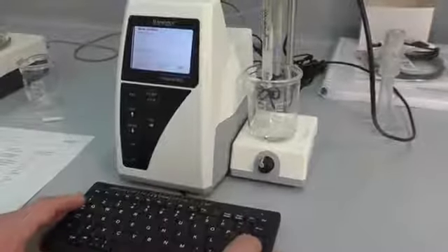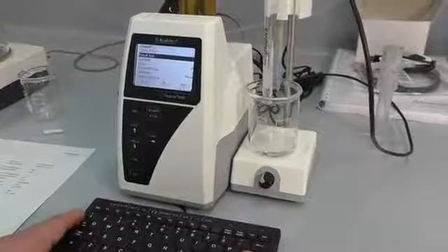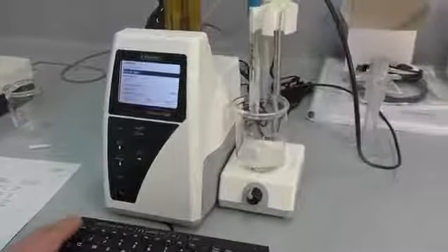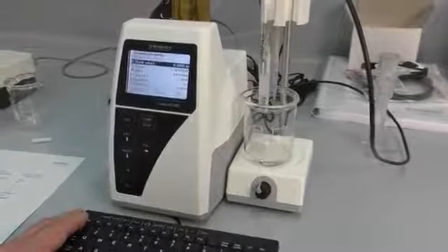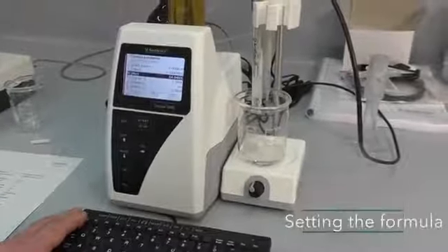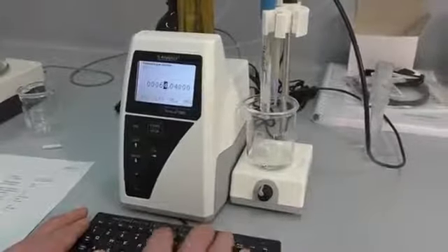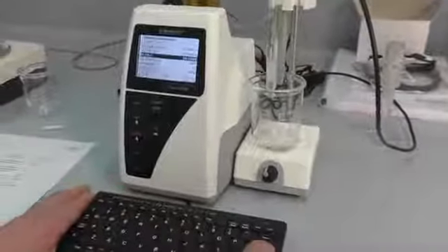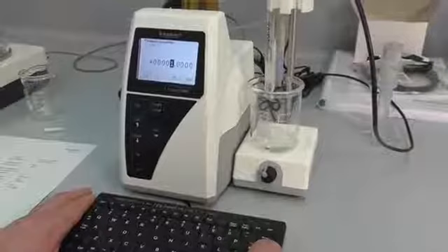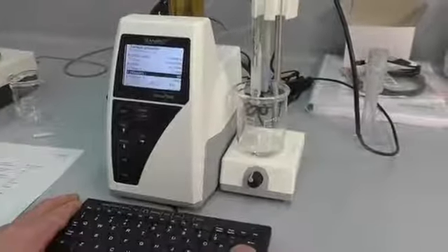Okay, fine. Next step is we have to change the result calculation, because the acidity is fine, but the formula has to be changed a little bit, because now we have the equivalent weight from citric acid. We will have to change it to the molecular weight of acetic acid. The factor has to be changed, because now we want to calculate in percentage, and percentage means gram per 100 gram.